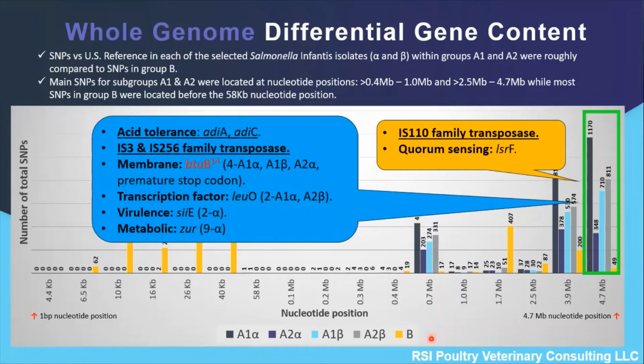Overall, we conclude that the analysis of genes carrying mutations was useful to distinguish between phylogenetic group A versus phylogenetic group B, and can be relevant to distinguish also specific isolates of interest.